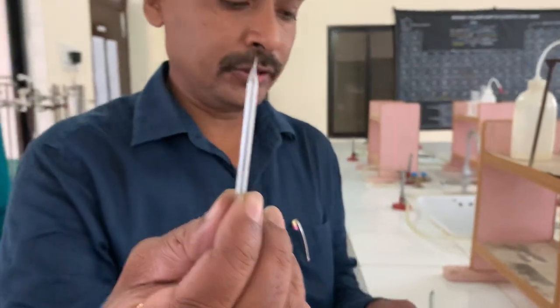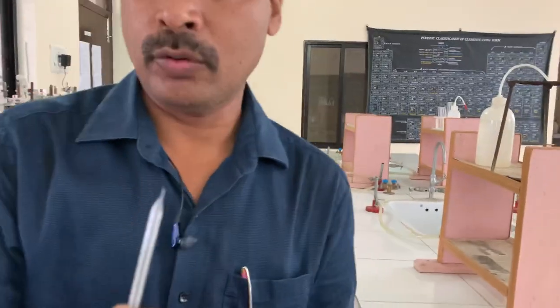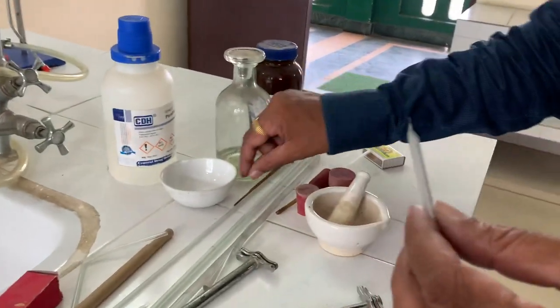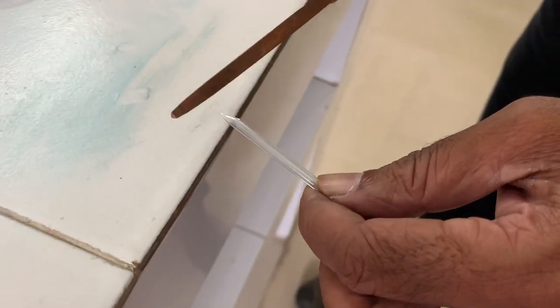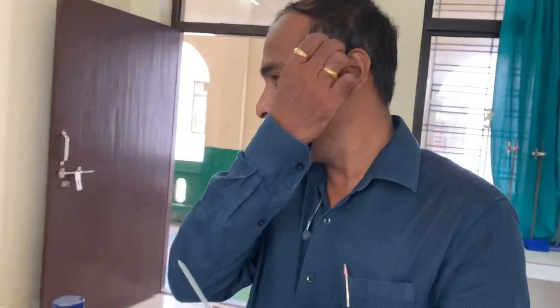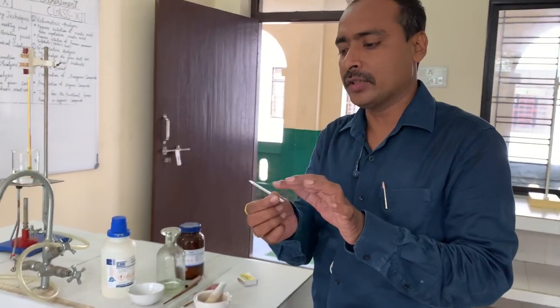You can see this is your jet — very sharp. Then what you do is just break the nozzle with the triangular file. You can see a very minute hole is there. You can use this nozzle for spraying or to wash the bottle using the nozzle.